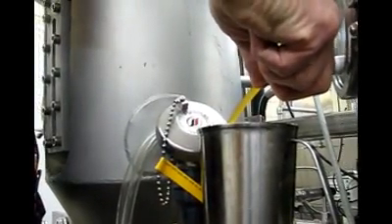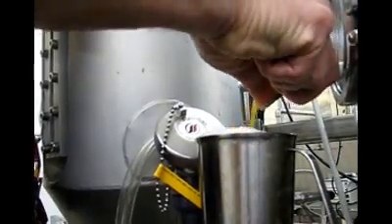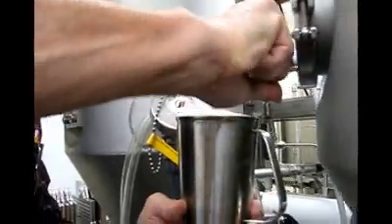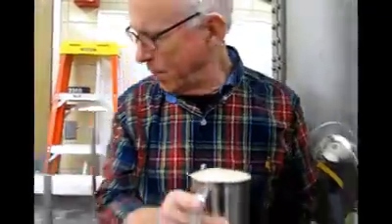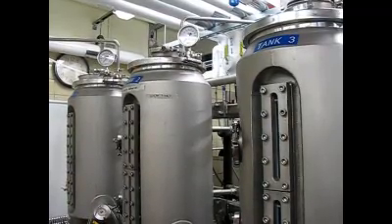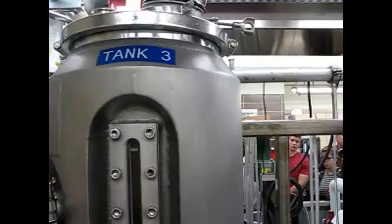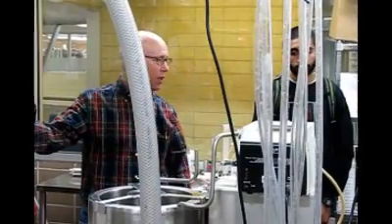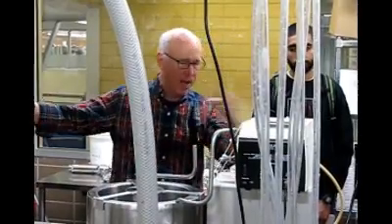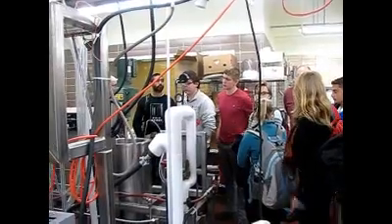I'm Hans Zorb and I'm a lecturer here in food science. The brewing system was a gift from Miller Brewing that they gave us about four or five years ago. It's a scalable system that's identical or virtually identical to the one they use in their own pilot plant. Scalable means that the things you develop and the parameters you use in this system should be transferable to a full commercial scale system.